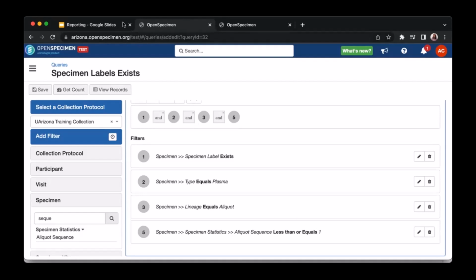Yeah, the attribute name is a bit confusing, but it actually means that it will bring the first available aliquot, irrespective of, say, for example, there are 5 plasma aliquots for a particular participant and you have given away the first aliquot, it will bring back the first available. So that will bring back the second one. Okay, I was hoping that's what it meant, because I wasn't sure if the sequence definition changed with availability. Yeah. Right now we might not have the exact data to show that, but can you click on view records, Geeta?